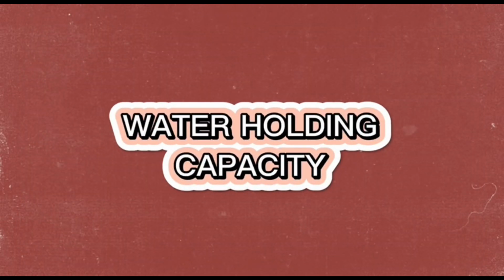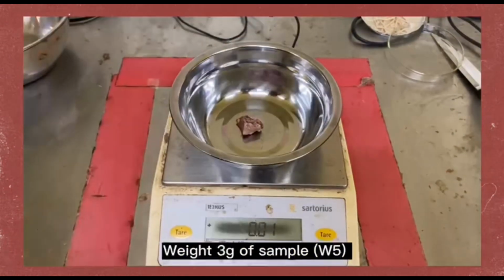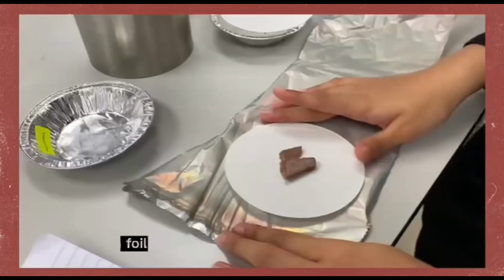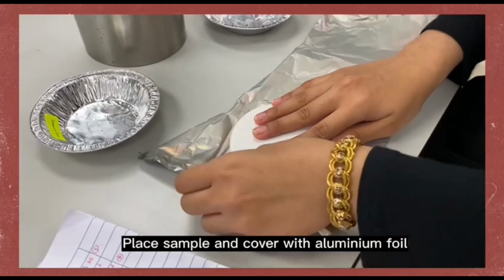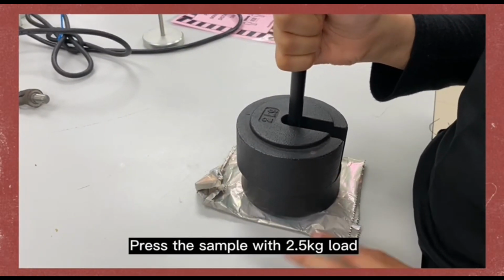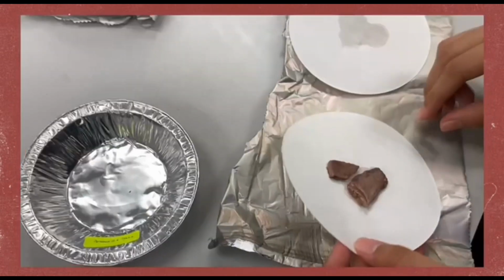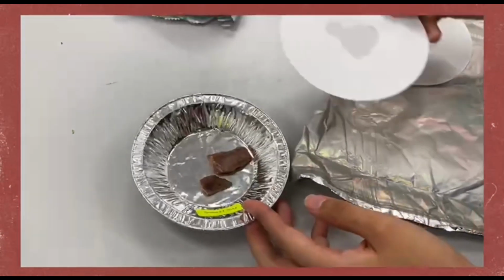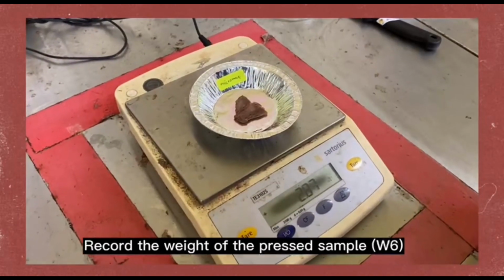Water holding capacity. Weigh 3 grams of sample, W5. Place the sample and cover with aluminum foil. Press the sample with a 2.5 kilogram load. Record the weight of the pressed sample, W6.